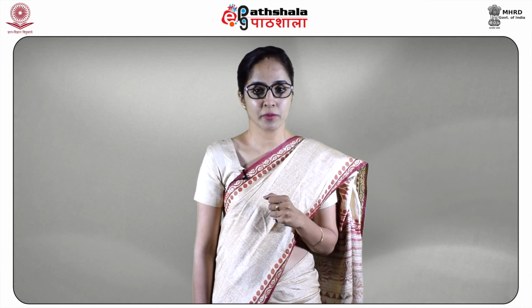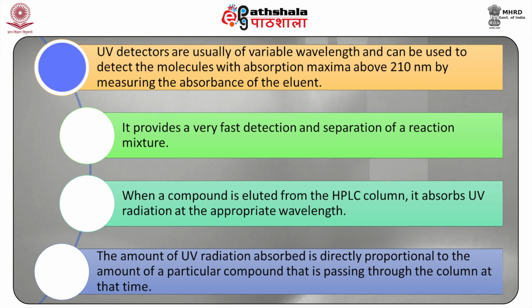Now students, UV visible spectroscopy may be used as a detector for HPLC. HPLC is a very high-end purification technique in chemistry, and it stands for high performance liquid chromatography, formerly referred to as high pressure liquid chromatography. Now, UV detectors are usually of variable wavelength, and they can be used to detect molecules with absorption maxima above 210 nanometer by measuring the absorbance of the eluate.